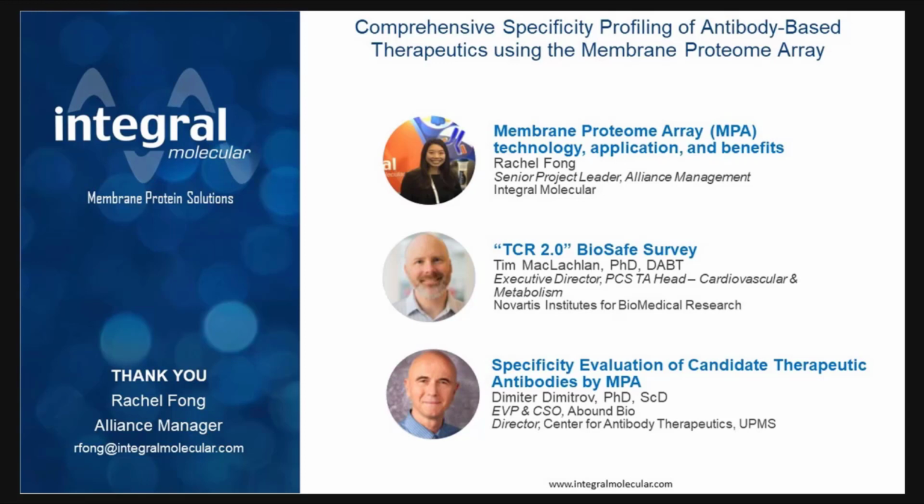Perfect, thank you. A question for Tim. You showed in your slides that TCR data has rarely led to a change in the clinical program. Is this because there are very few off-targets found by TCR, or that the off-targets found are not relevant?